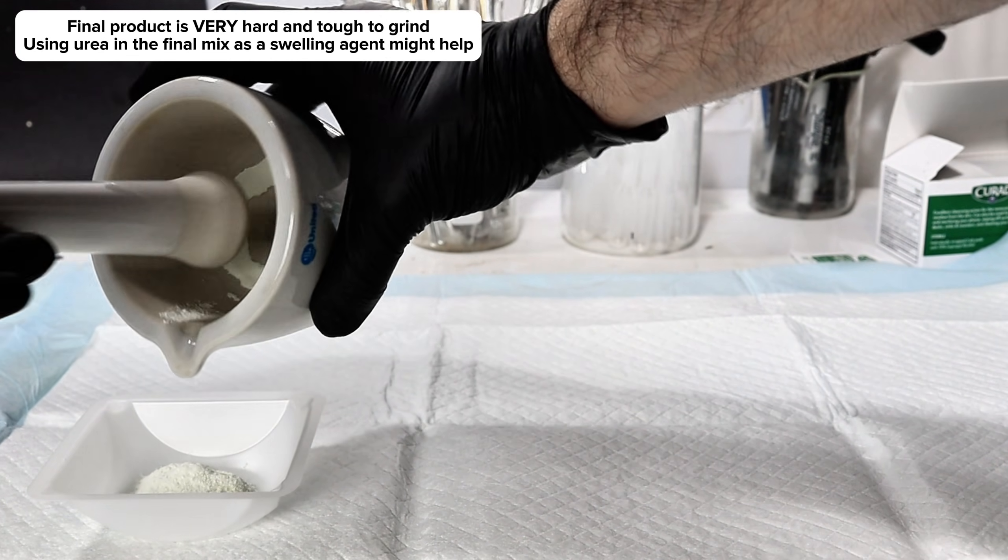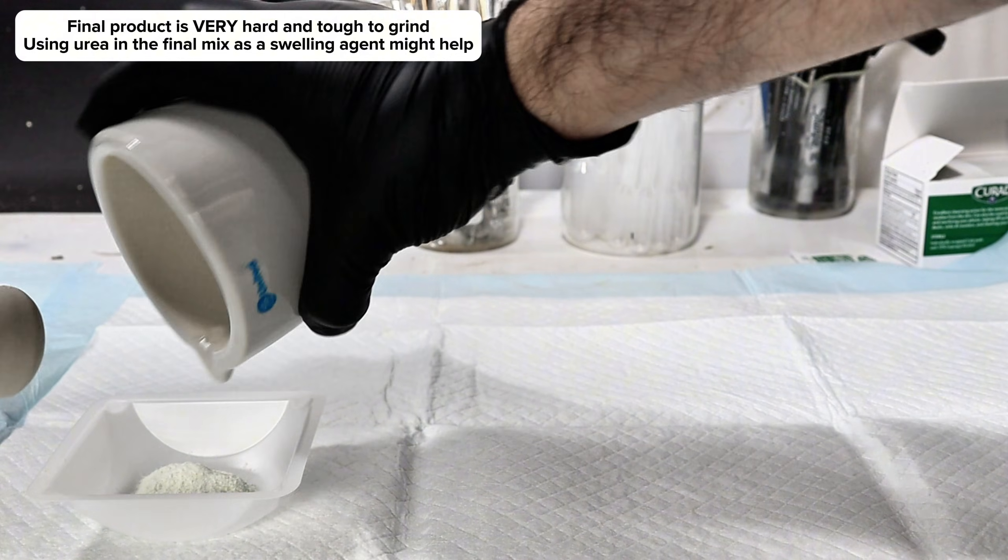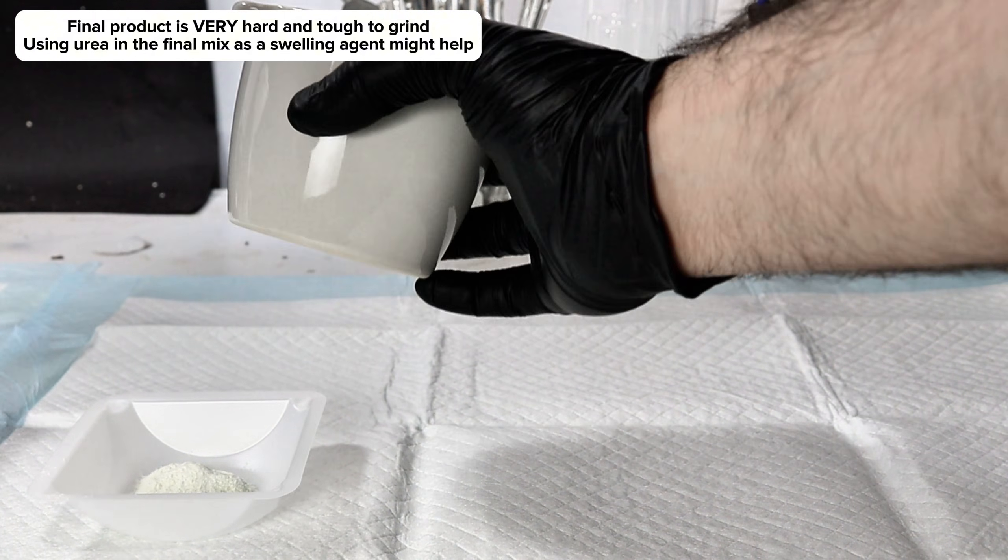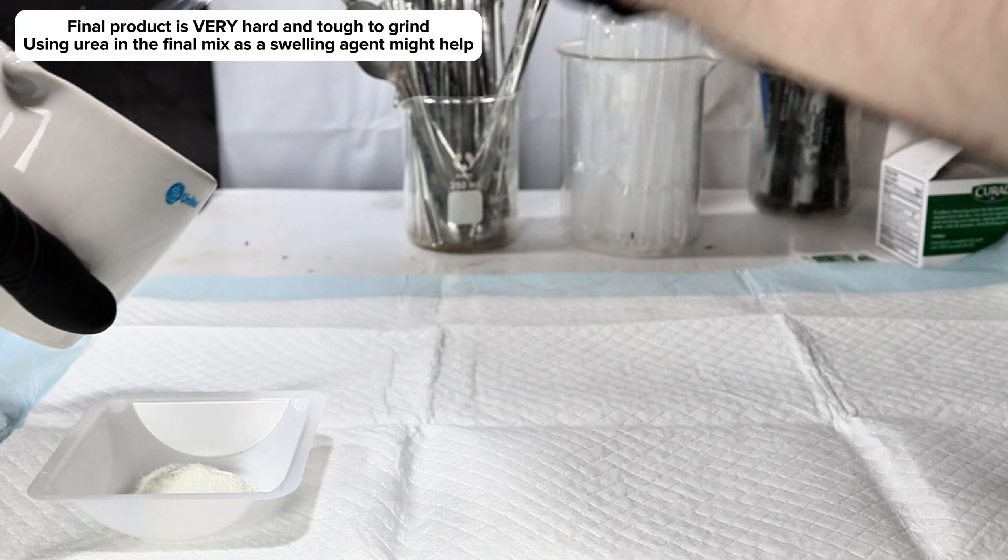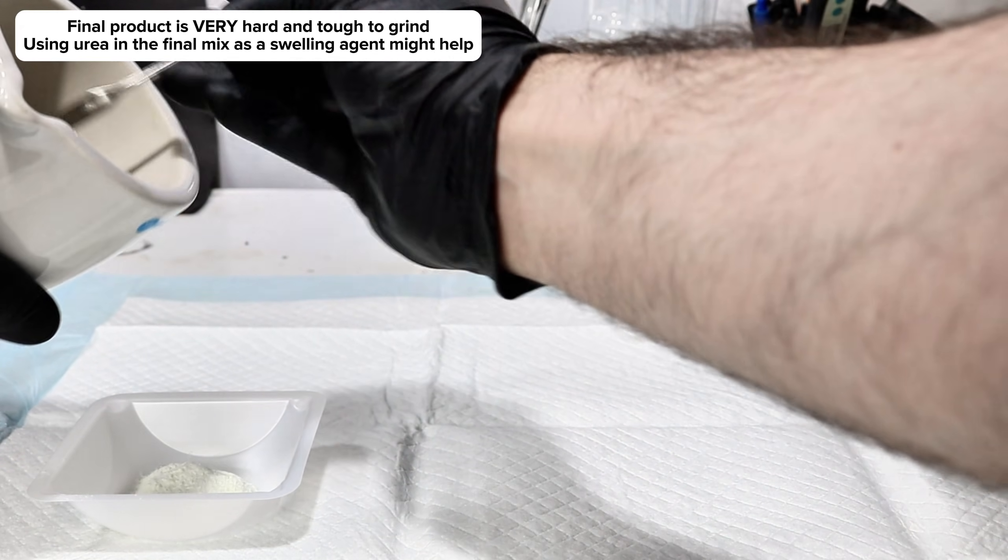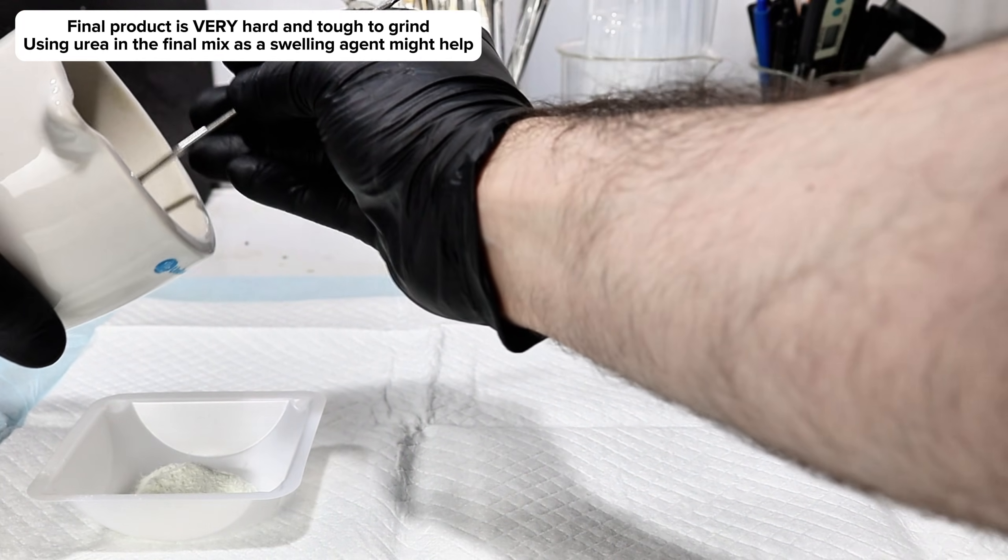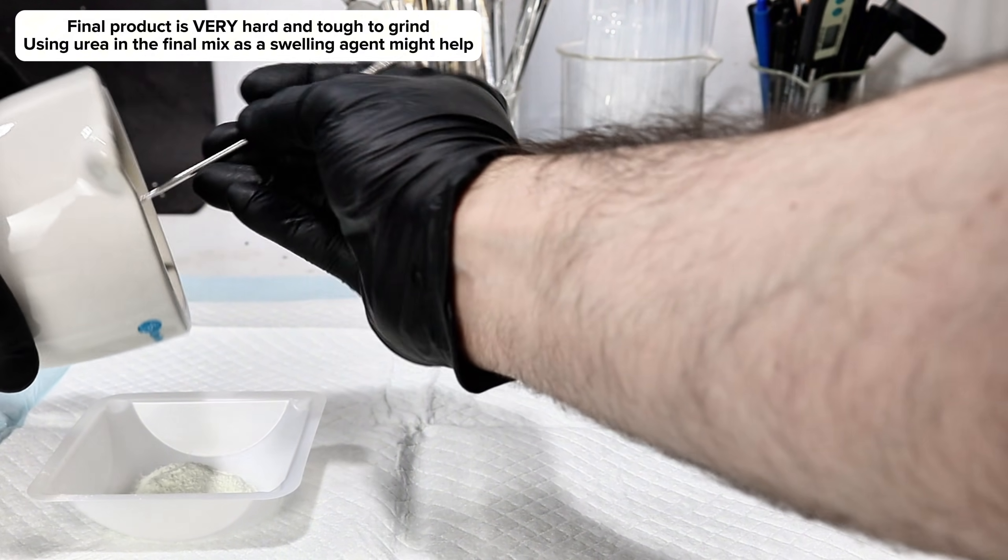In the course of my research, I did come across a method to make the final mass easier to powder by the addition of urea as a swelling agent prior to the final firing, but I wanted to remove any unnecessary variables from this process given I was already having such a hard time with it.